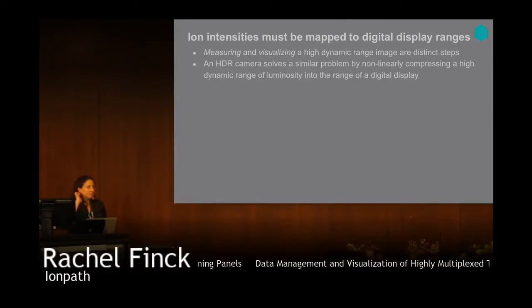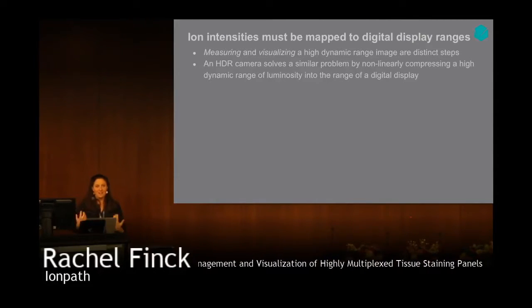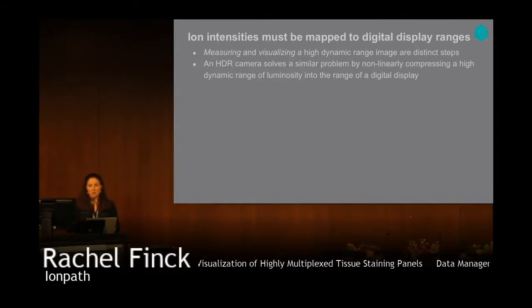And in the spirit of Adib earlier talking about, for the scTECH, exactly the transformations of the numbers that get it to look like CyTOF data or other things, going back to quantitatively, what do these numbers represent? How do we rescale them? How do we set axes on them so that they're meaningful? That's similar to what I'm going to reference here.